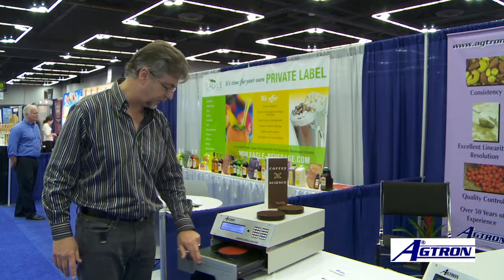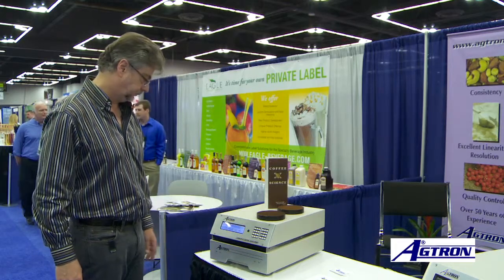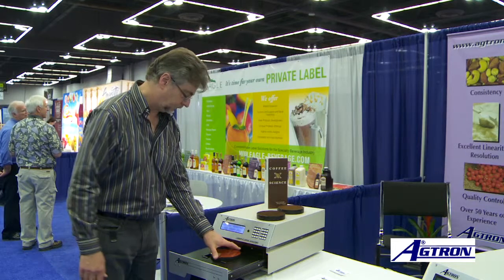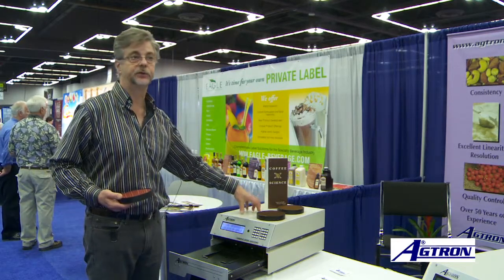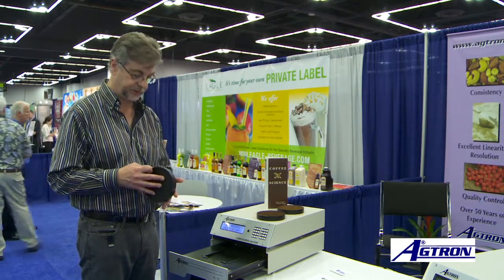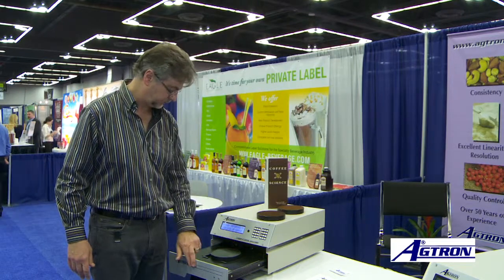We'll introduce that to the analyzer. When I open the drawer this time, the analyzer is looking at another disc that's under the drawer, and it's going to store that reference for future calibration. So I do this, say, at the beginning of a shift, beginning of the day.